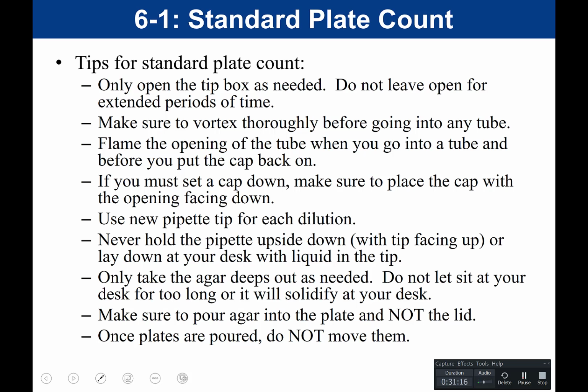So before and after. If you must set the cap down, which again, hopefully you don't because you could put the cap between your pinky and ring finger, but if you absolutely must set the cap down, make sure to place the cap with the opening face down so that, again, bacteria doesn't fall into the lid.